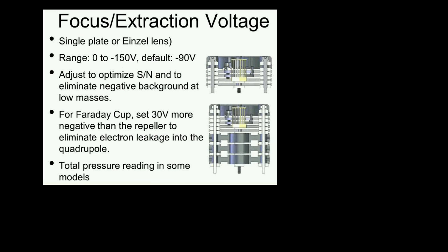Okay, we talked about this already. And the last thing I want to mention to you in terms of the focus and the extraction voltage is that I described the focus electrode as a single electrode.